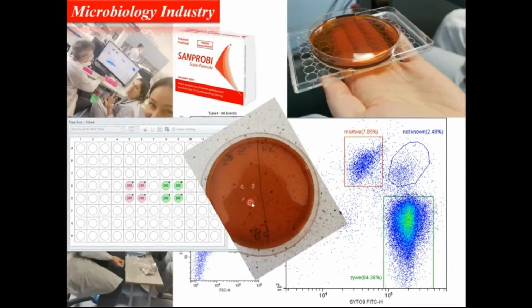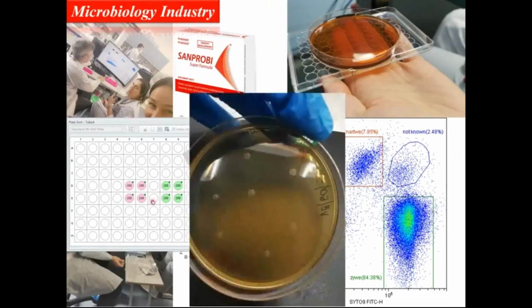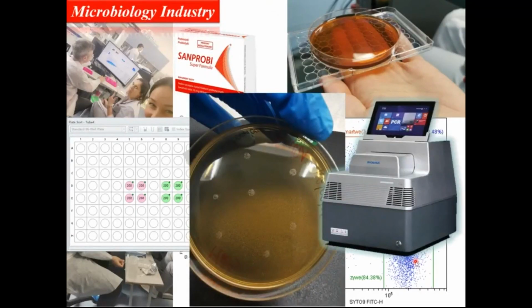Only those ones that we placed in. We can do similar stuff. We can grow or select different populations that we don't know what they are. Afterwards, once we have the colonies well formed, we just move them into PCR and we can identify them and come back. And now we know population 1 is this group of bacteria, population 2 is this other group of bacteria.